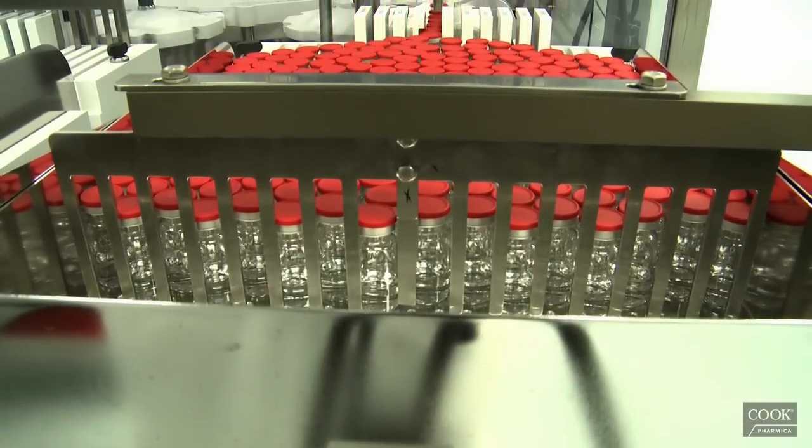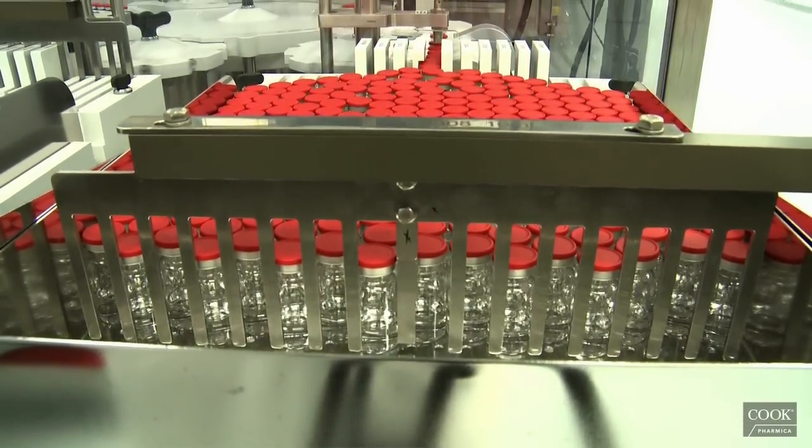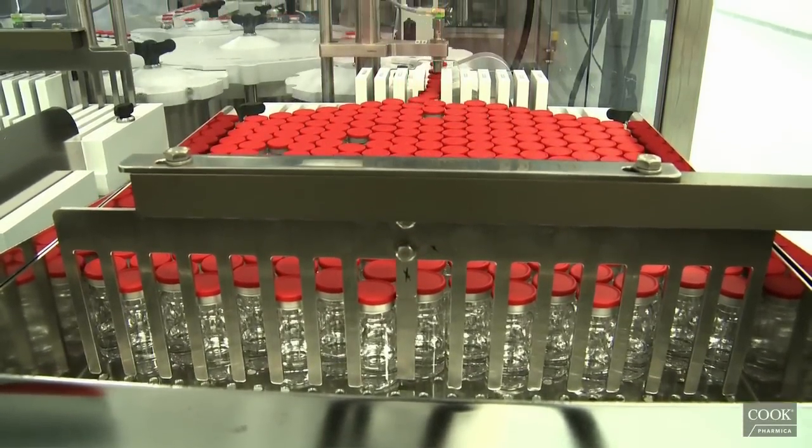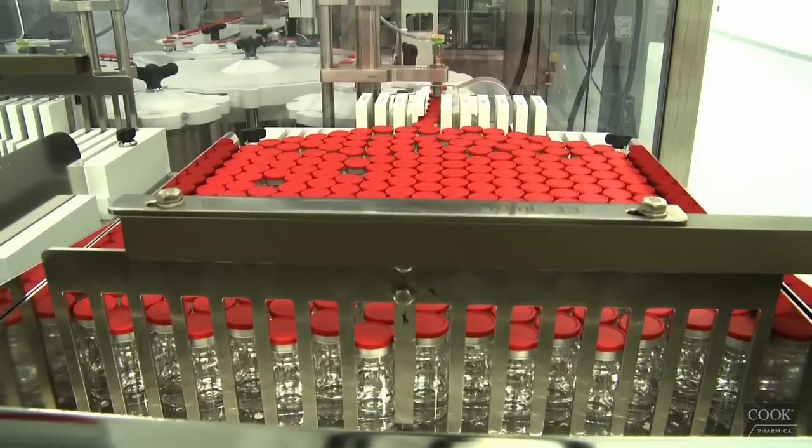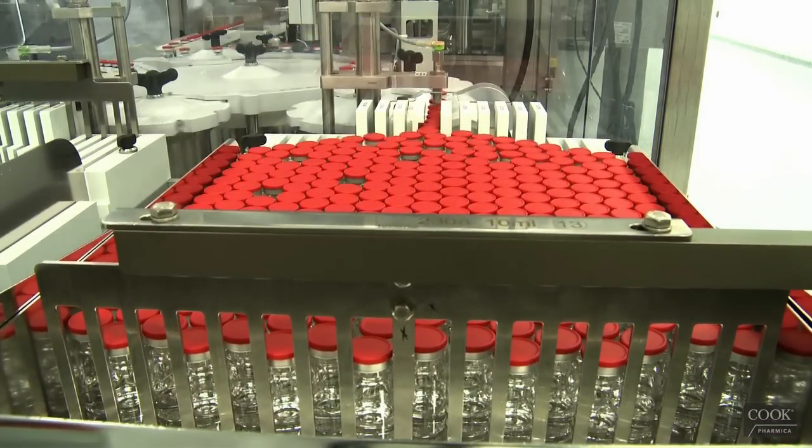During tray loading, vials are identified with UV excitable barcodes or human readable inkjet screening on the caps. The vials are also counted as they are loaded into the trays.